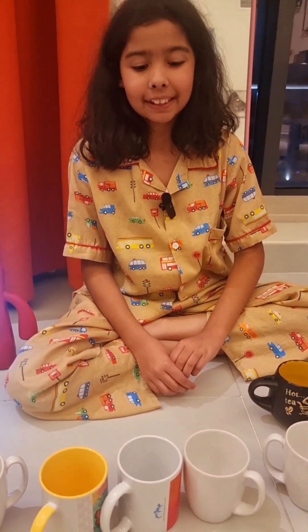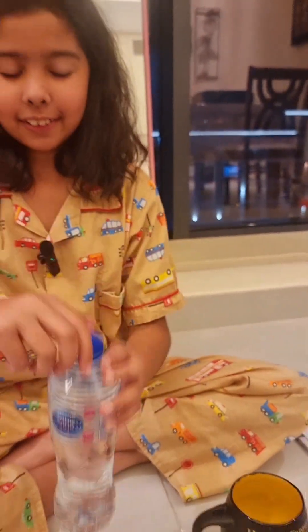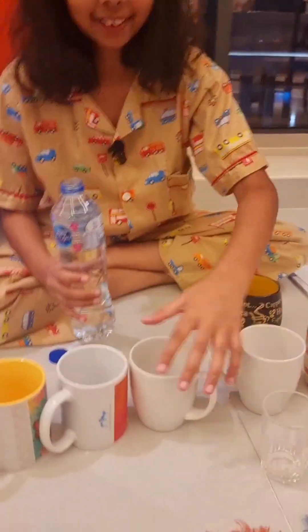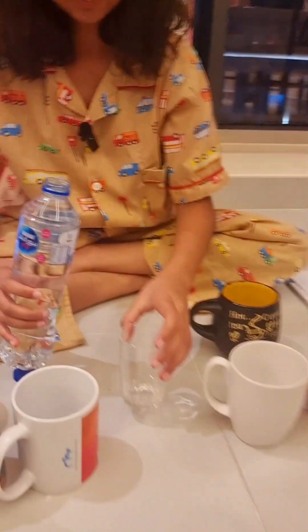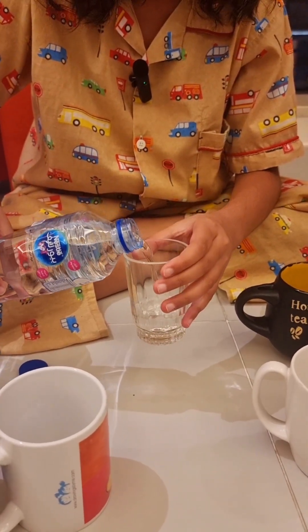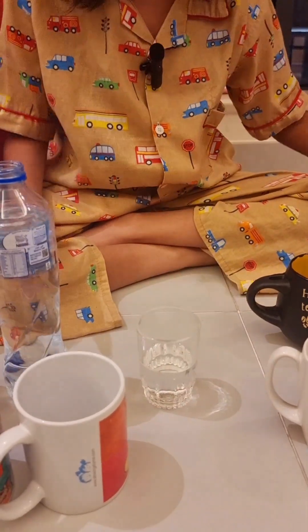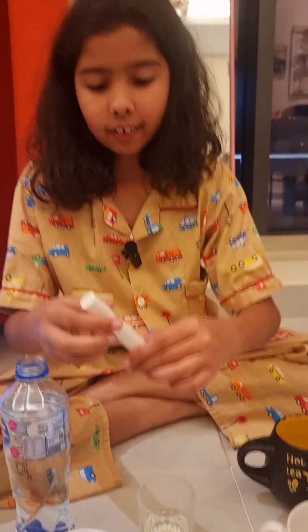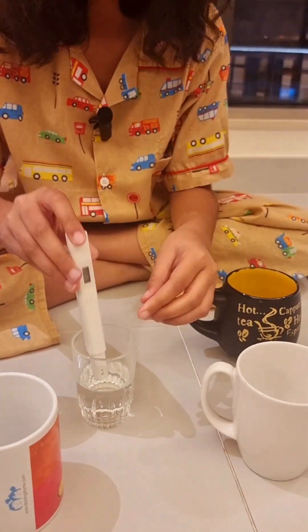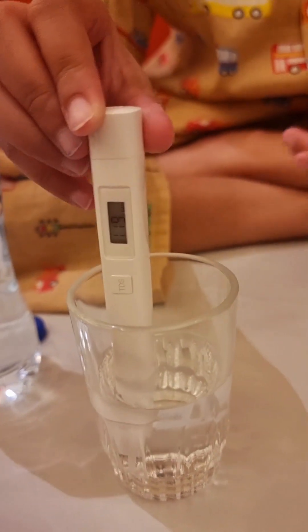Now we're gonna begin with our experiment. Let's start with Nestle water. Let's open it up and pour. Now let's take our TDS meter and put it in. We have 118 — wow, that's pretty good. That's pretty good for this brand.